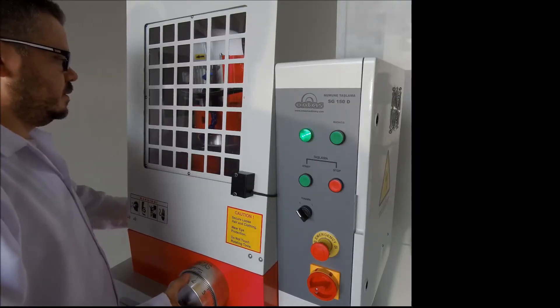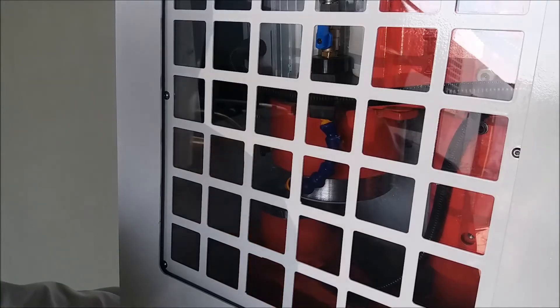Slowly turn the hand wheel until the stone touches the sample. When the stone touches the sample, move the moving arm back and forth and make the sample move under the stone.